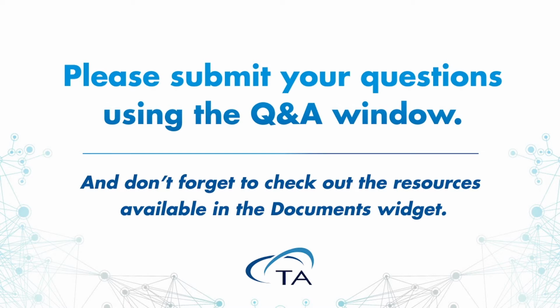No, we haven't, because they will take months, and obviously the main goal is to have a very quick identification of either the antibody or the solution conditions that guarantee maximal stability. So if you do the experiment, let's say at 40 degrees or 25 degrees, it will take a year or so to complete. And in that case, you can just as well use size exclusion chromatography and directly measure the amount of monomer or high molecular weight aggregate. So in principle, you can do the experiment, but I don't see what the point would be. Right, because you've already shown in one of your slides the size exclusion chromatography data at 25 matching up very nicely with your elevated temperature studies. Okay.